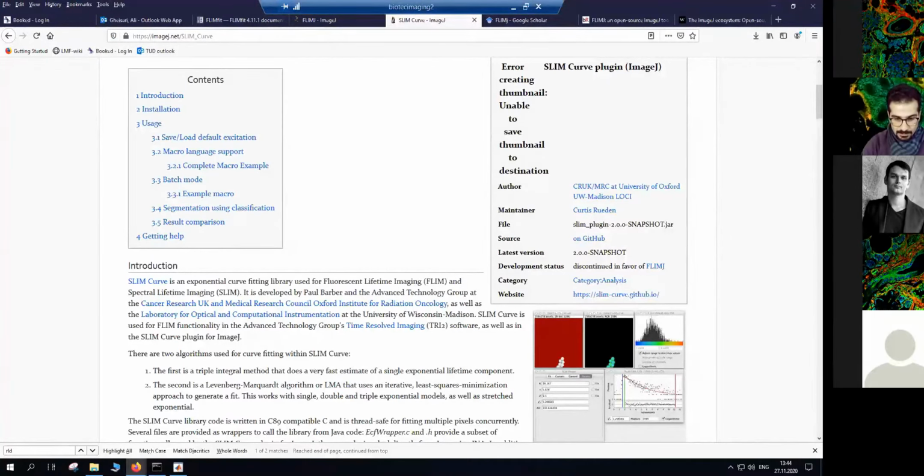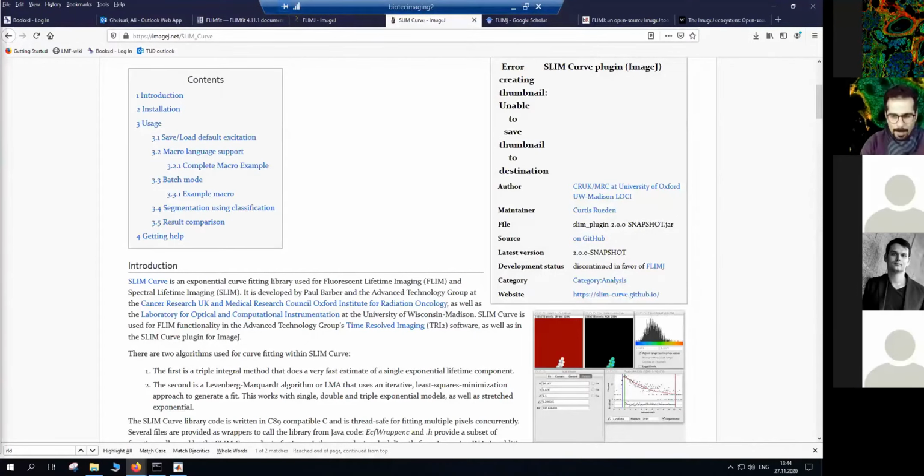So I just go back to the chat to see if there is any question. Stefan, Thomas, Steffi, was there any question that I was missing? It's mostly about being able to read files or not, but the chat is more discussion than questions, I would say. Yeah, it's about OMERO, because at the moment you cannot easily load the files to OMERO. Okay, great. But PicoQuant knows, and also the OME team knows. So maybe now, after establishing a new community, there will be more pressure on them to solve it.